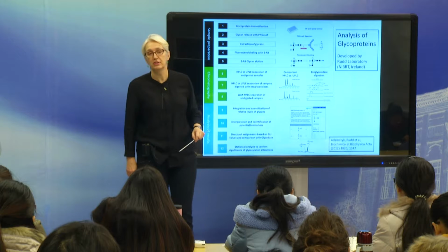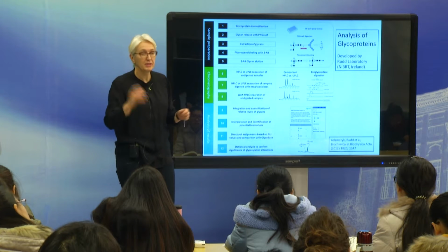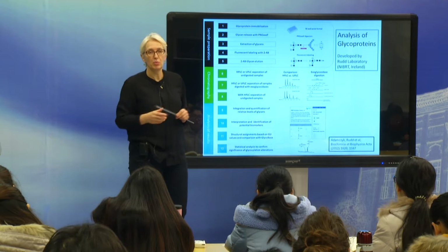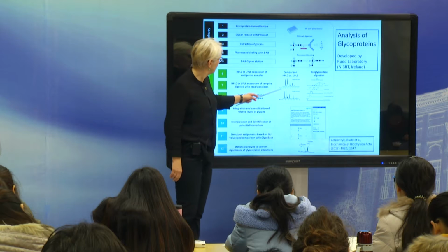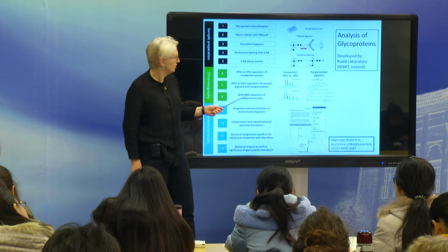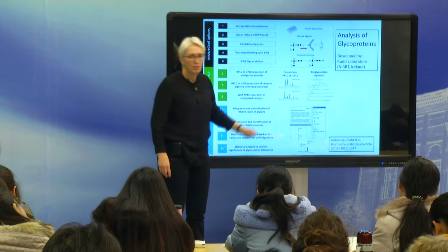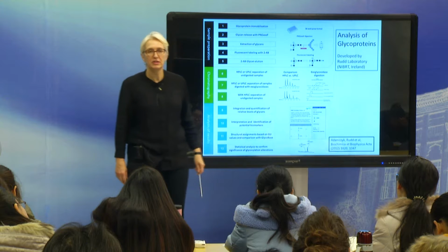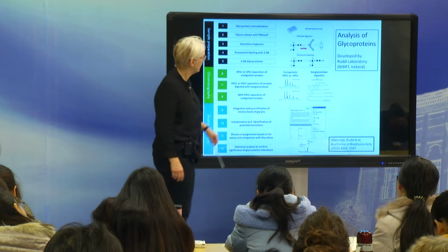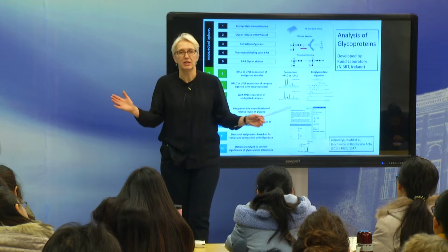And you need that for this type of analysis because you have lots and lots of samples and you want to compare samples and you want to be very precise. So this technique has been totally optimized. It's particularly useful with a HILIC column, hydrophilic interaction column, which is very useful to get these nice peaks. And each peak here will just be a different fluorescently labeled glycan. Minute amounts, because you have a fluorescent label. So you have that, but obviously that is just a retention time.